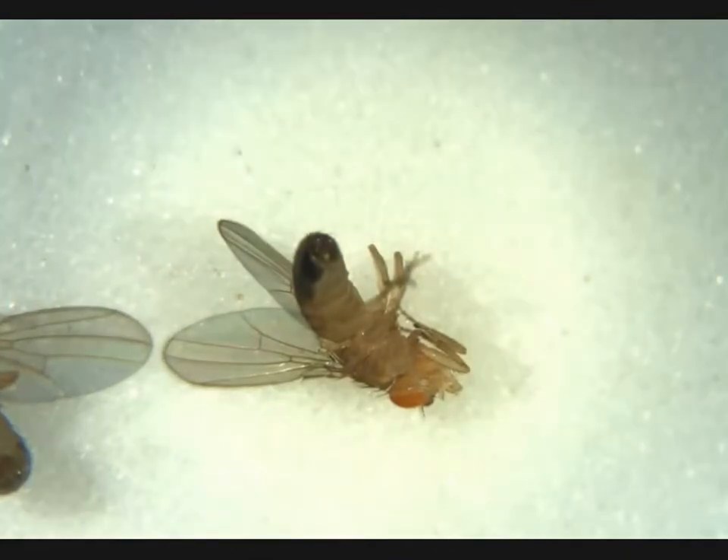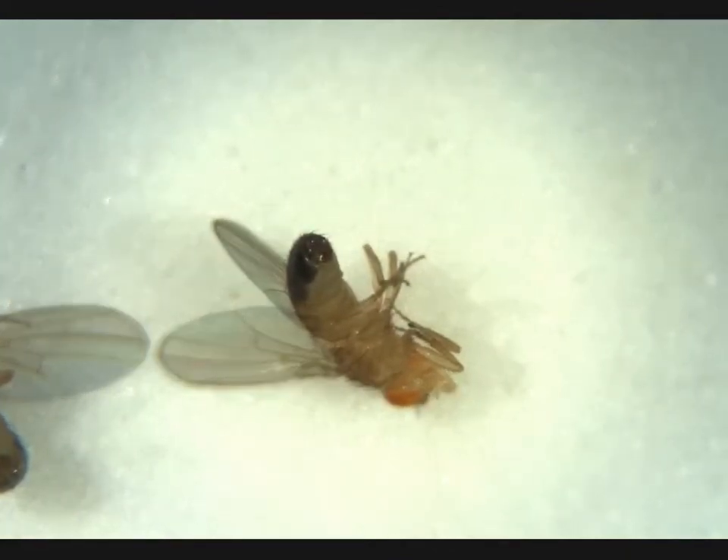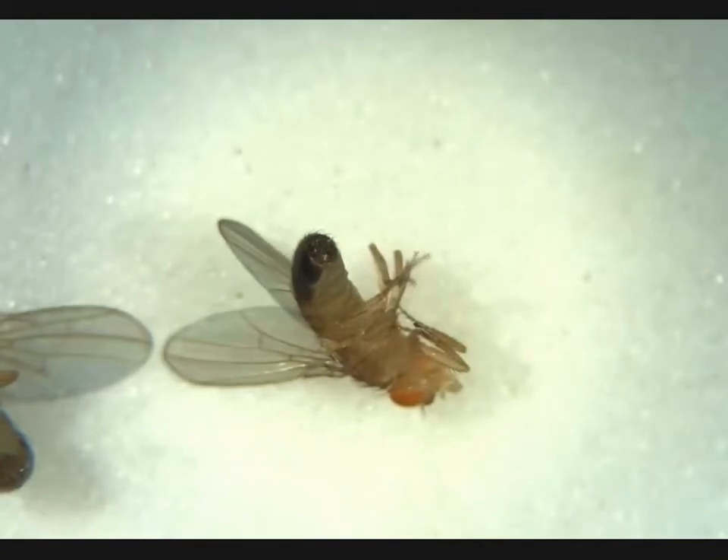Here we have another female. No penis apparatus, no obvious meconium — adult. Here we have another male. We'll adjust our focus. We can see a penis apparatus here. That's an adult male, no meconium.